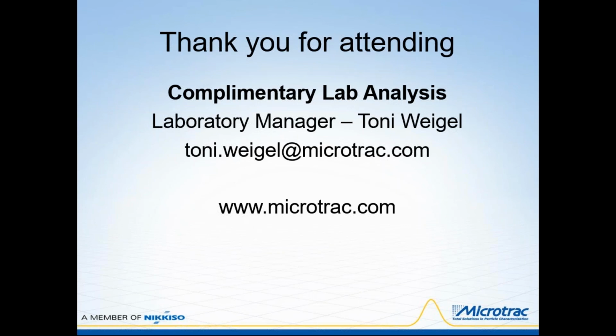That would be about 10 microns on the lower size limit of 5 microns and about 50 microns on the PartAn 3D.